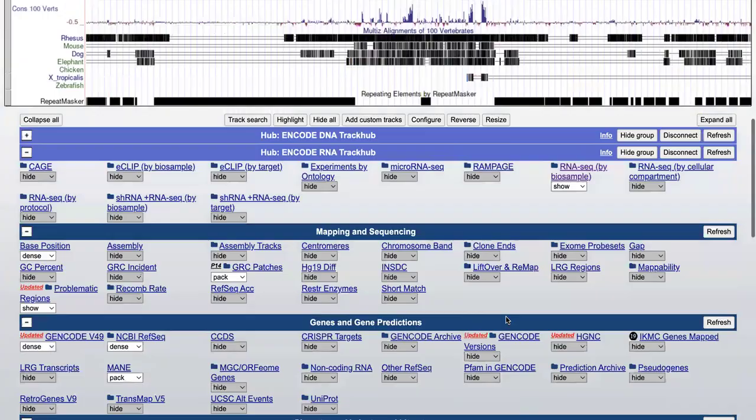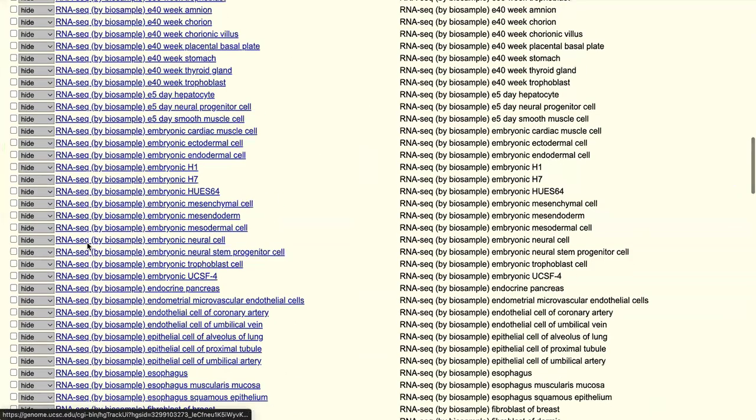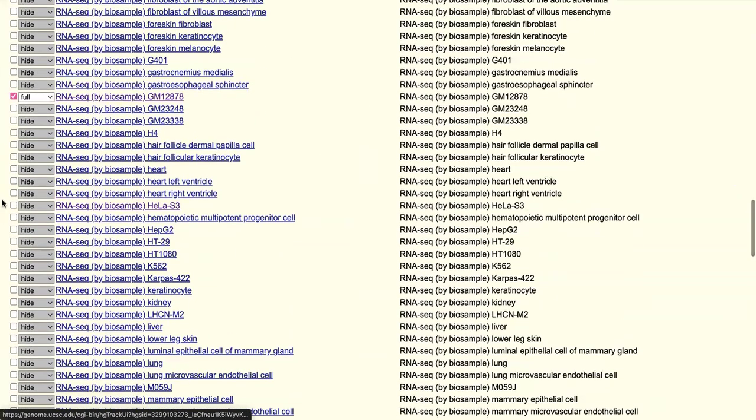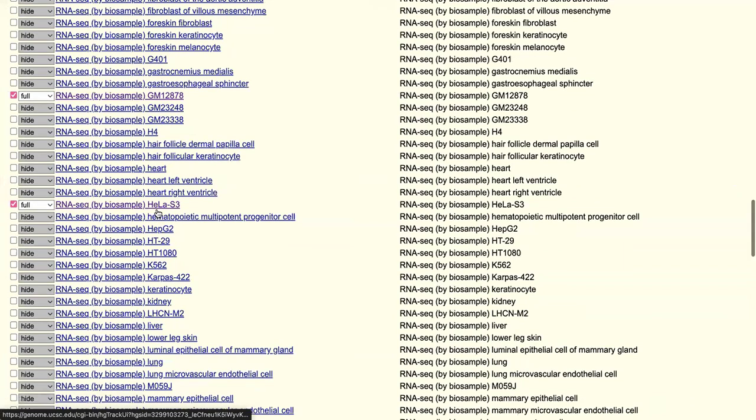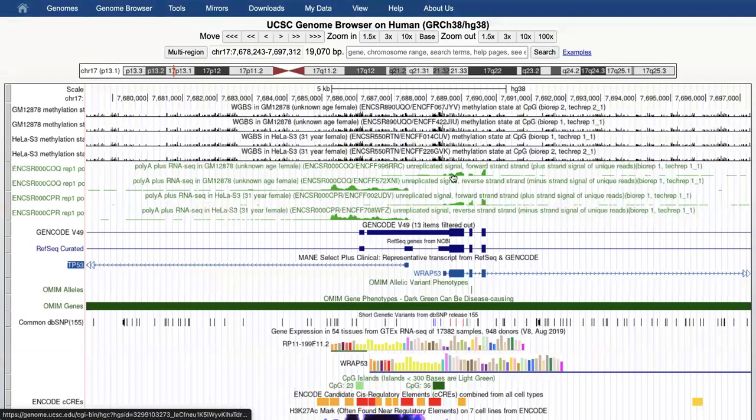Oops. Sorry, I don't think I set that one to full. Nope, I didn't. Let's select that there. All right, now we can go ahead and submit that, and we should see it show up. There we go. All right.